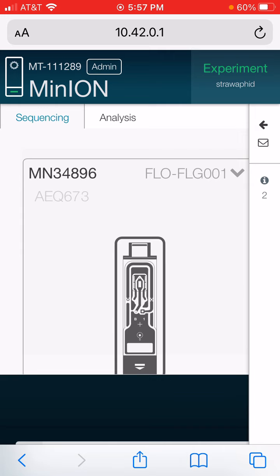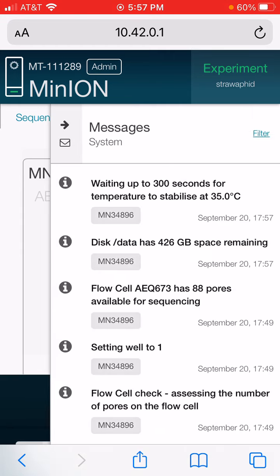I'm going to click on my envelope here on the upper right. It says experiment in the upper right, straw aphid. It's identified the MinION sequencing device. It's set on sequencing. It's got our flow cell in there.